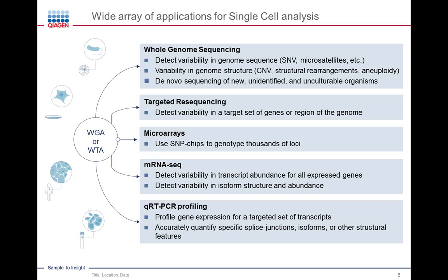And finally, if you're interested in qRT-PCR profiling, measuring the transcript abundance or the expression of a single gene or a single isoform or splice variant of a gene, you can also do this on a single cell.